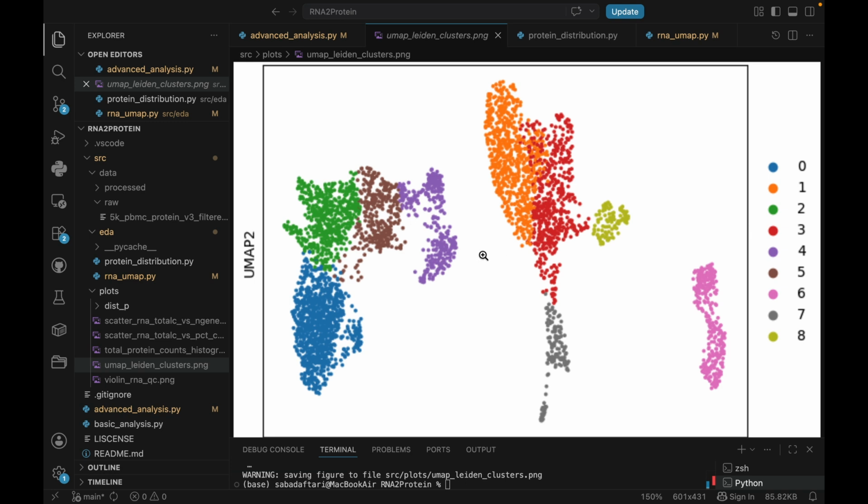The fact that we have 3 well-separated blobs with visible white space between them shows that we have 3 major cell lineages, to the point where even after compressing 20,000 dimensions to 2, they are still far apart. This is a good sign for our model. The RNA space has clear structure and major cell type boundaries are unambiguous.